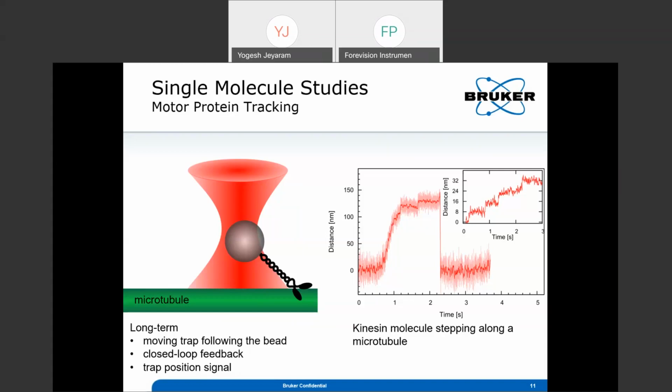And once you've done that, you can hold the DNA and you can flush your channels, and then you isolate the DNA in a static condition, no flow conditions. Then you can do your stretching experiments, and that's how you do it. And there are many creative ways to play this. Your limitation is only our imagination, right?